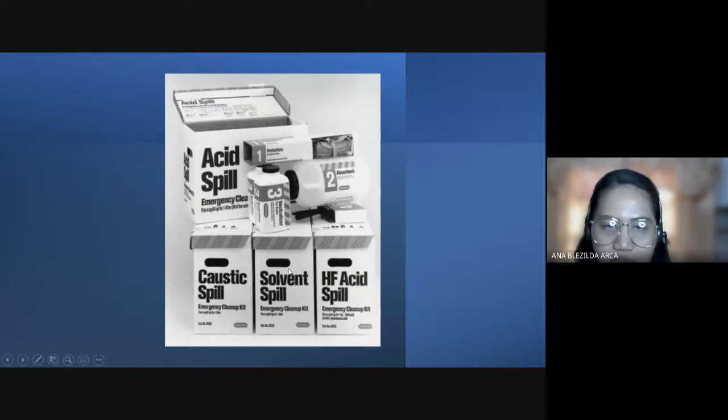So this is the example. Yan, example ito ng mga spill kit na tinatawag natin. So kapag daw natapon ng acid, ito yung gagamitin mong kit. For the caustic chemical, these are the kits. For the solvent and also the acid spills. So those are example of spill kit.